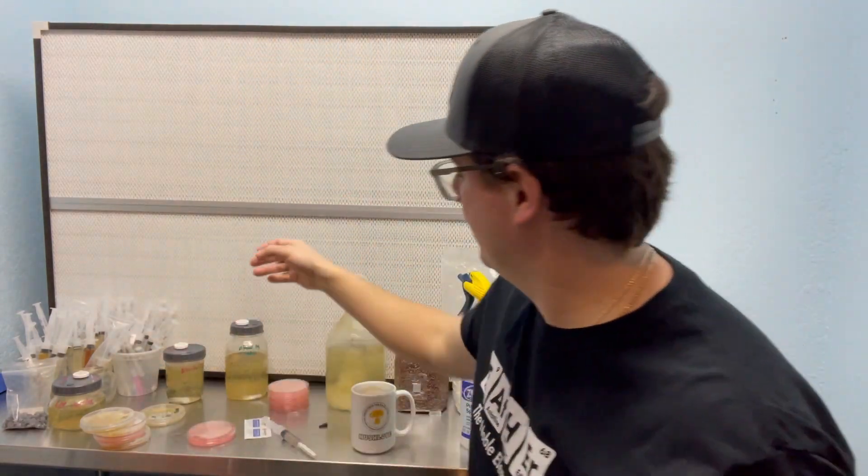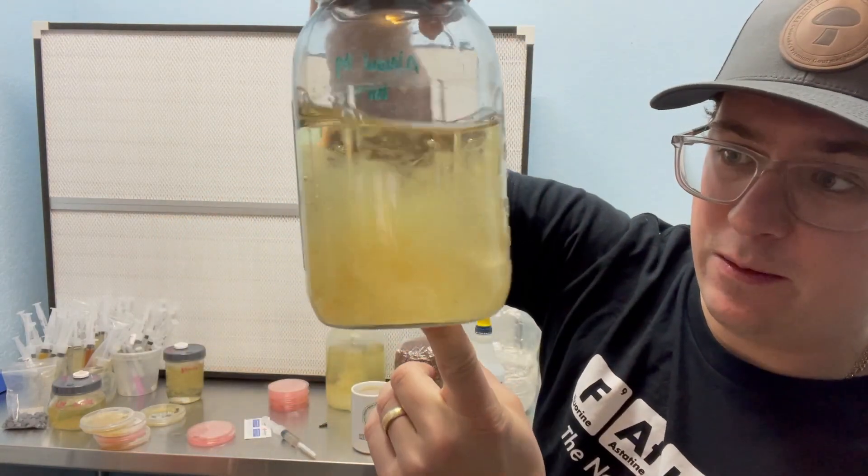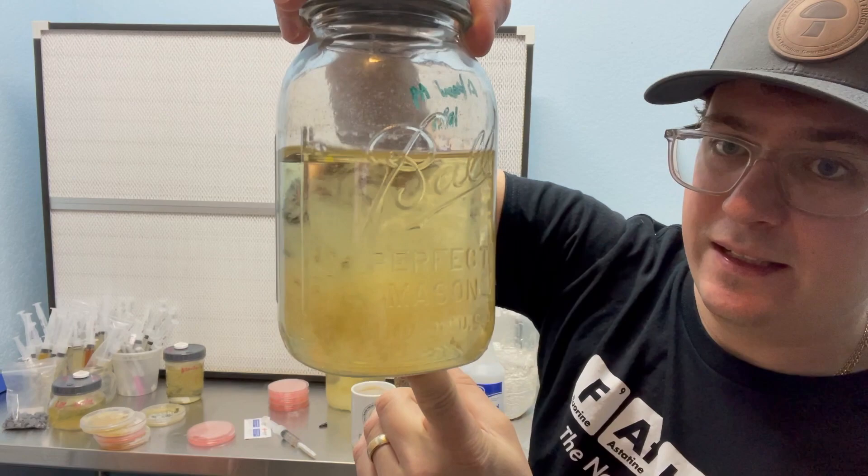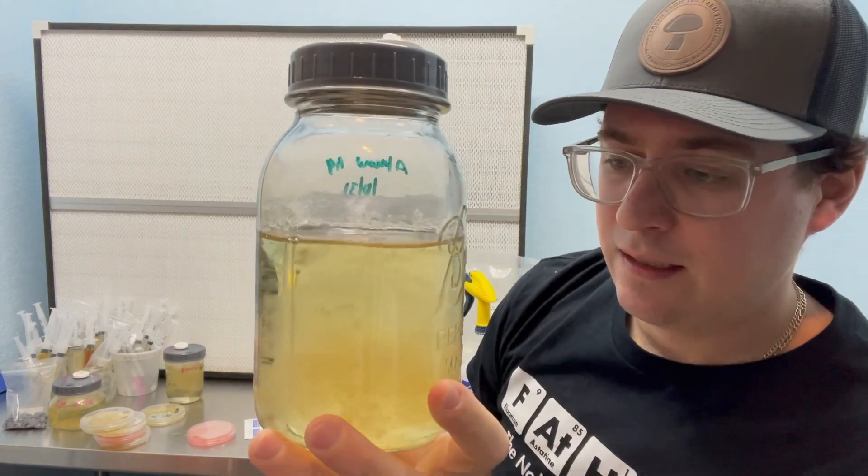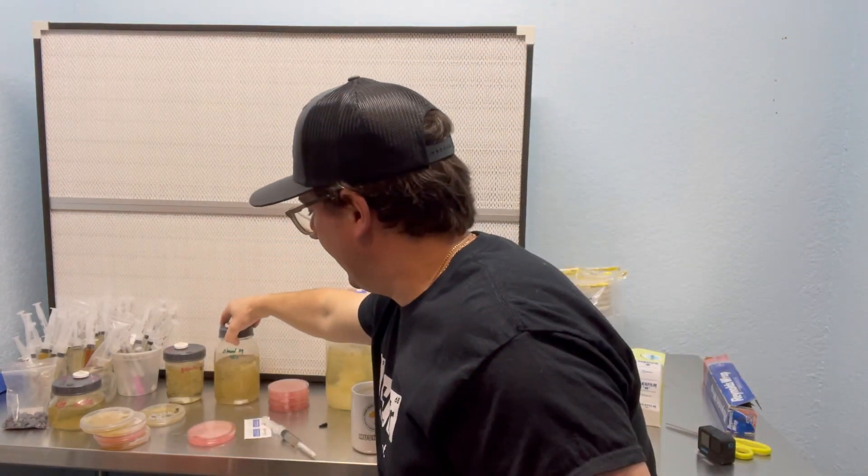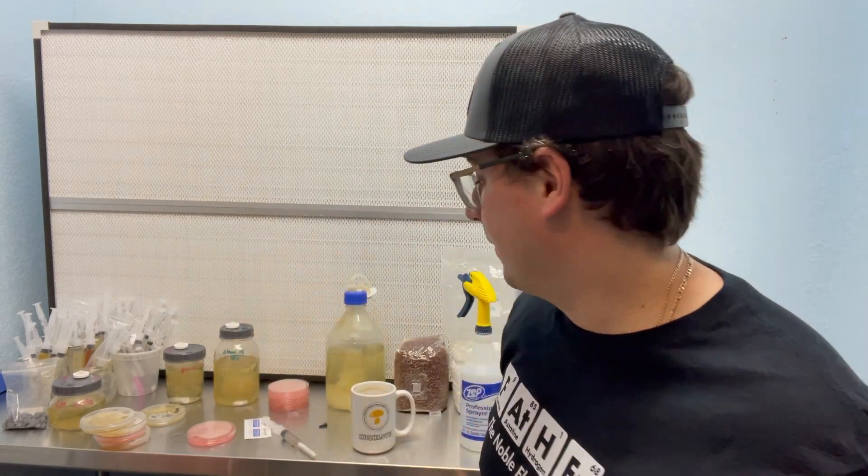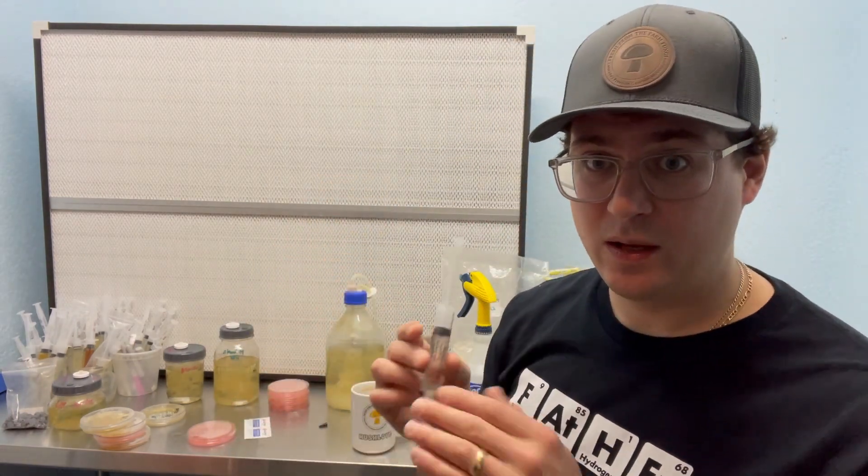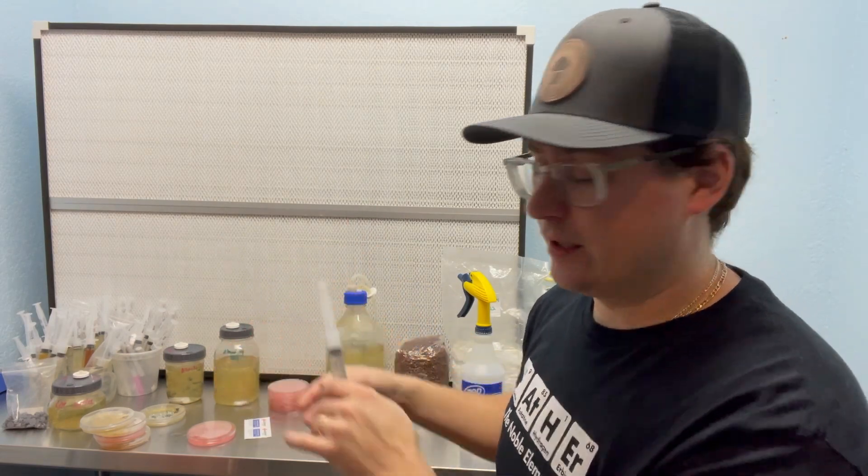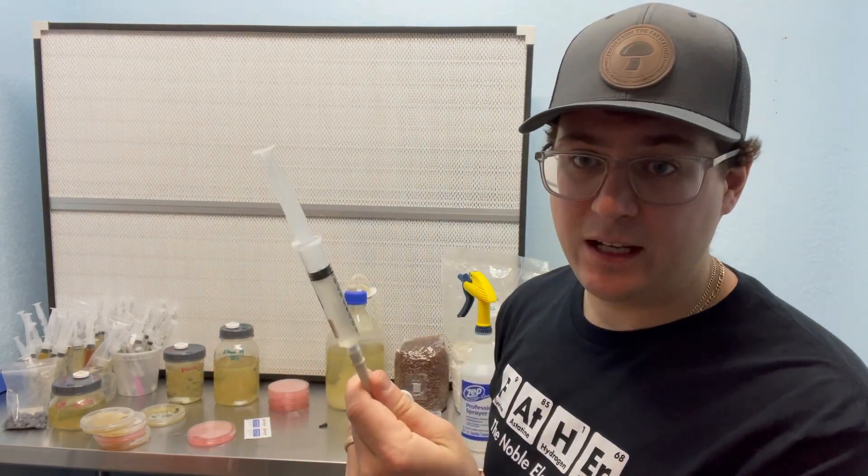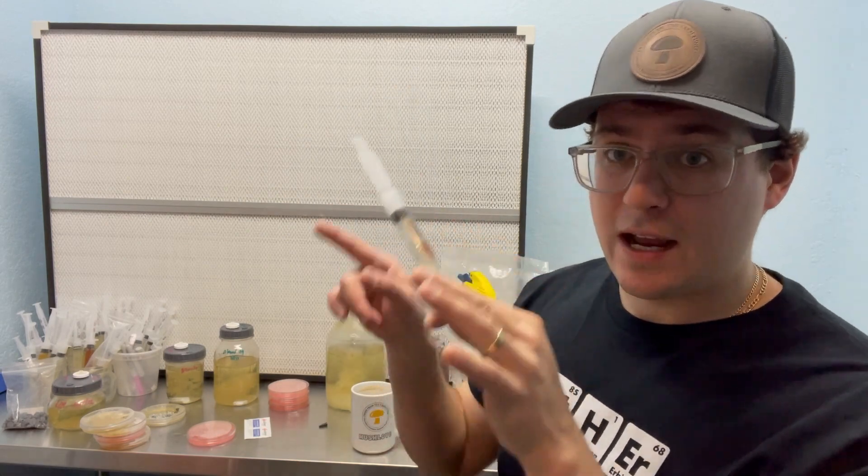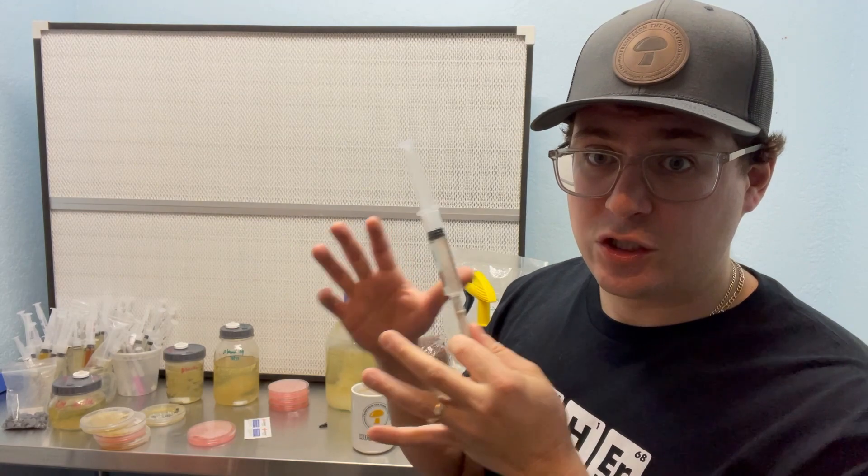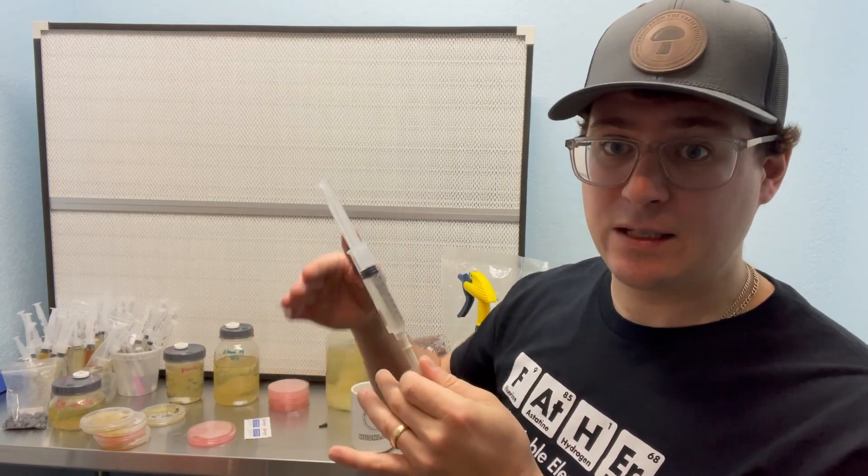But sometimes you can't tell if a liquid culture is contaminated. So this is an Agaricus species. It looks clean, but it's often a good idea to test on agar so you verify if it's clean or not, otherwise you're not going to know. So the next thing you can do with liquid culture after receiving it is to expand into a bigger liquid culture. If you haven't seen my video on how to make liquid cultures, go check that one out. But basically it's just a sugar water solution that has been sterilized.